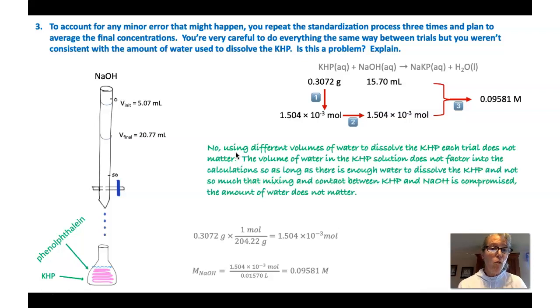Using different volumes of water to dissolve the KHP each trial doesn't matter. As long as we use enough water that the KHP properly dissolves and that mixing and contact between KHP and sodium hydroxide isn't compromised, the amount of water doesn't matter and your results should be just fine.